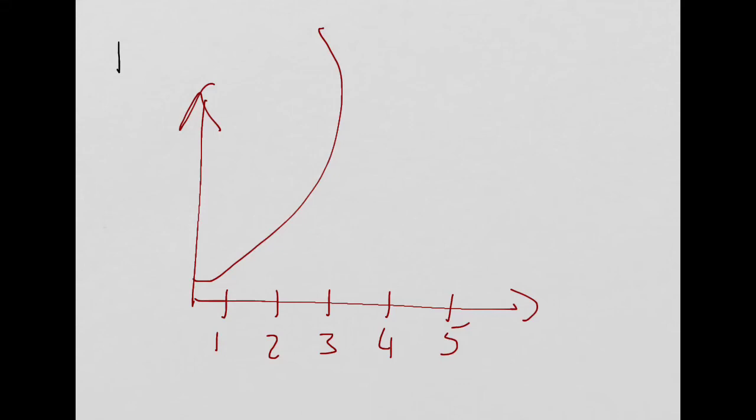Well, he says, I labeled my tubes. Okay. I put in the concentrations that you set. And then I measured the absorbance. That gives you this? Yeah? I've done it 5 times.